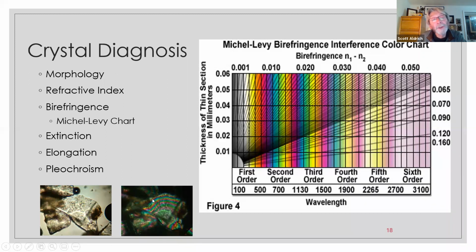So if you look at the perimeter here, see how it's grayish into red right there? And then you can count the color fringes as you go up in thickness. So at this thick point, we're 1, 2, 3, 4 color fringes in. And so we're up into the 3rd and 4th order on this chart. And it's a way to visually, quickly say, oh, gee, I think I've got grains of XYZ in this sample because I know at a certain thickness, there'll be a certain color. Sort of reverse engineering for crystallography.